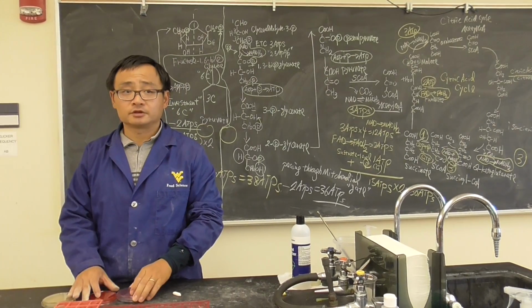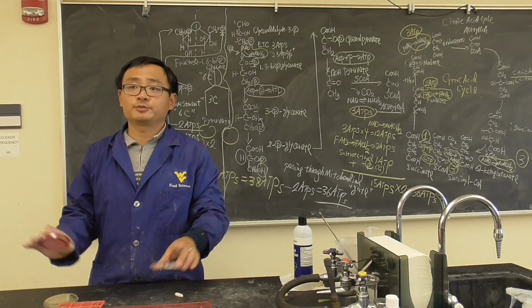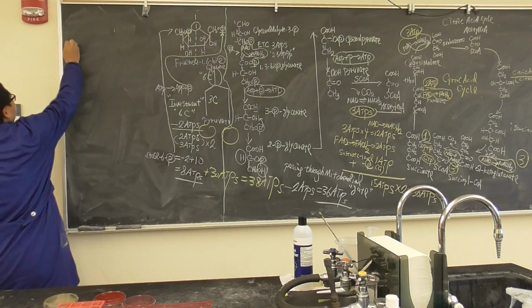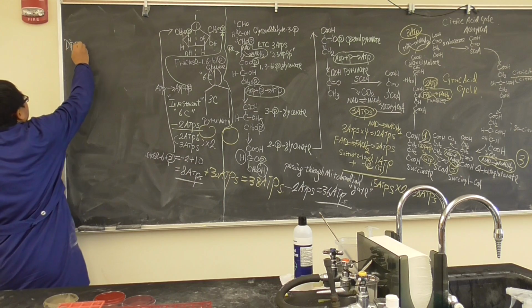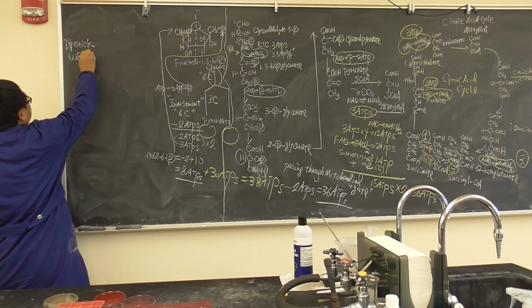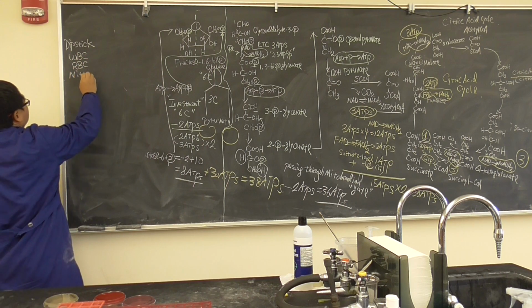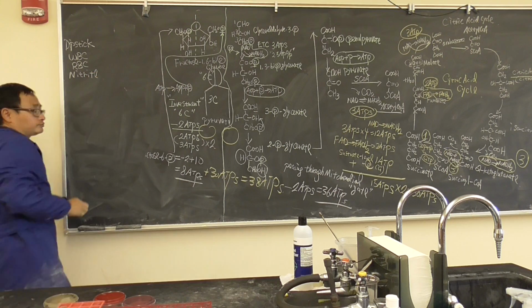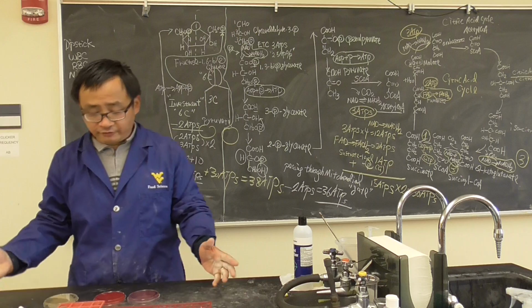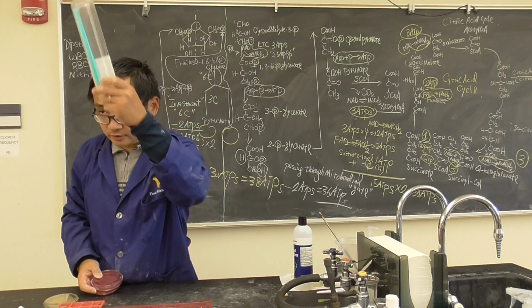Very important. I'm assuming the dipstick is all good. Dipstick is looking for 3 things. What are the 3 things? Do you remember? Dipstick: white blood cell, red blood cell, and nitrite. It's all negative. Now we do a confirmation test using the sterilized loop. Remember, no contamination.